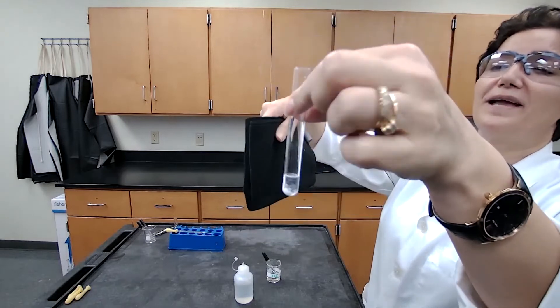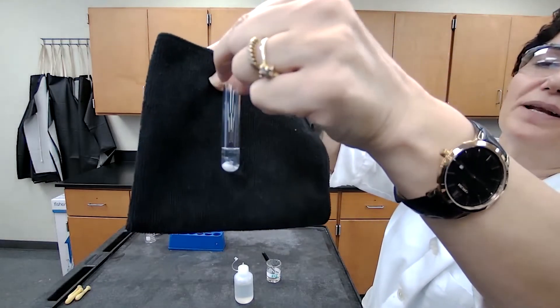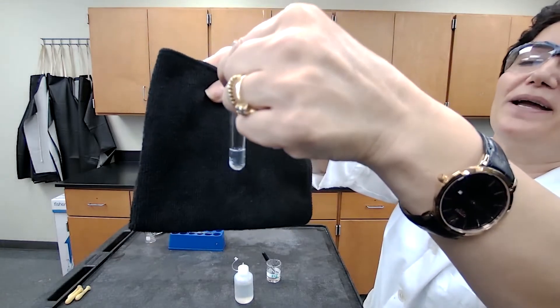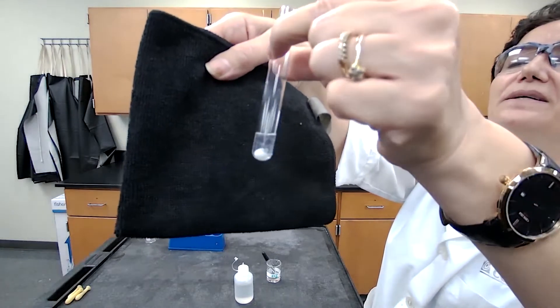After the centrifuge, we have a clear solution and a precipitate at the bottom of the test tube. If I bring it close and rotate, you should be able to see the white precipitate and the clear solution.